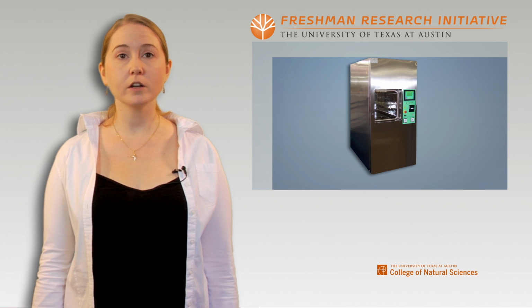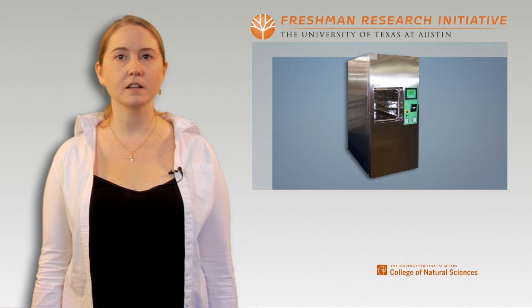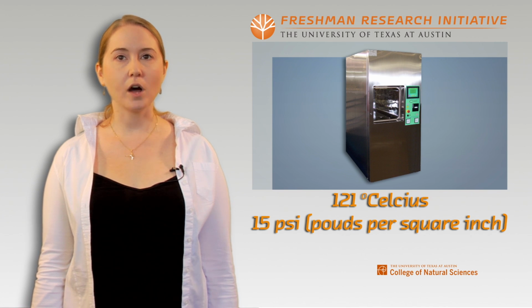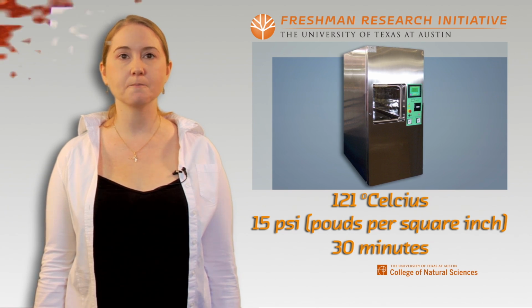Biohazard waste must be autoclaved before discarding as regular trash. Autoclaving is a method of sterilization that uses high heat and pressure to kill most microorganisms. The autoclaving time depends on the amount and type of waste, and at a minimum must be 30 minutes.